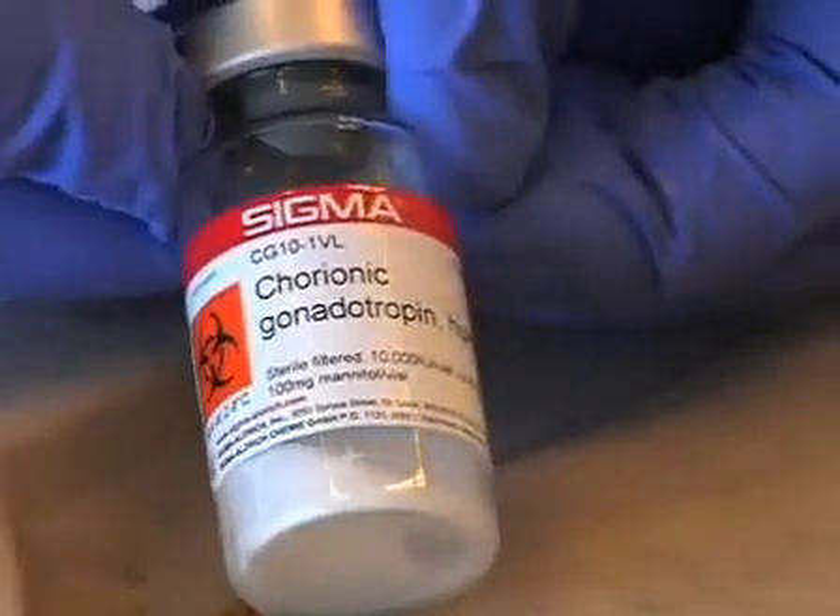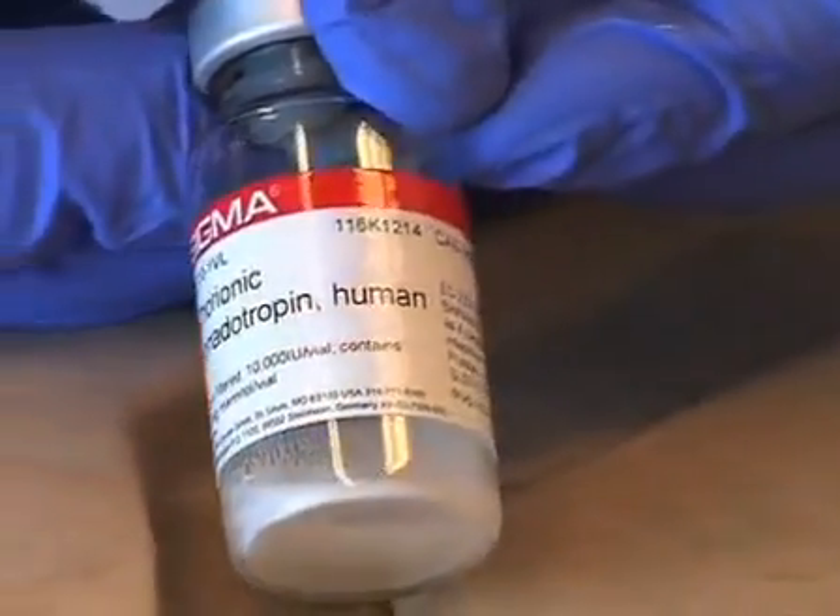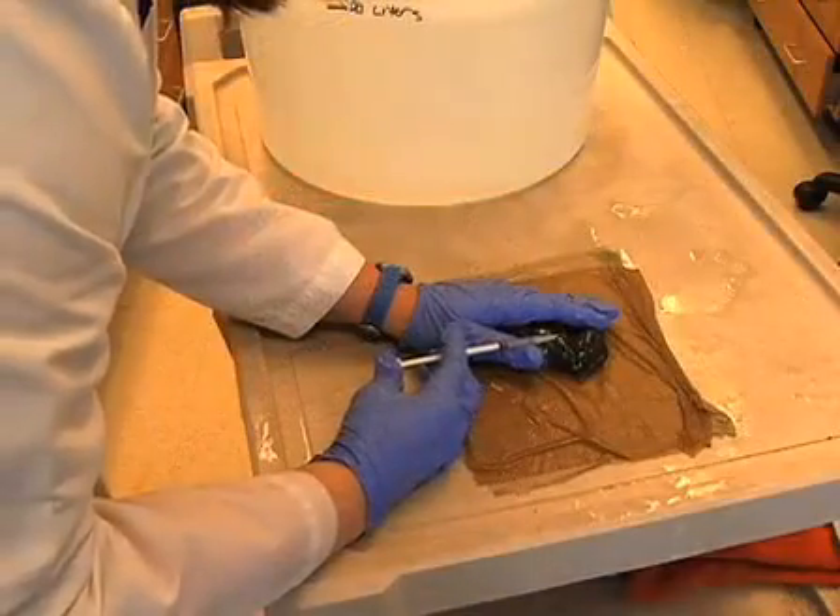After 2 to 3 days, induce egg-laying by injecting frogs with 0.5 ml of 100 units per ml human chorionic gonadotropin. Inject subcutaneously.